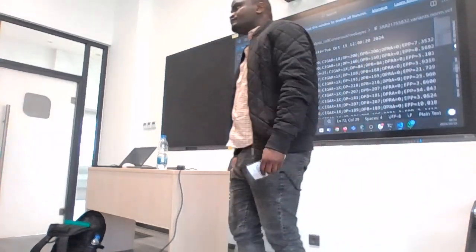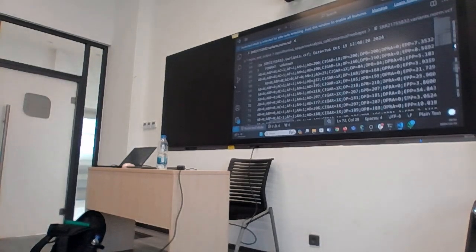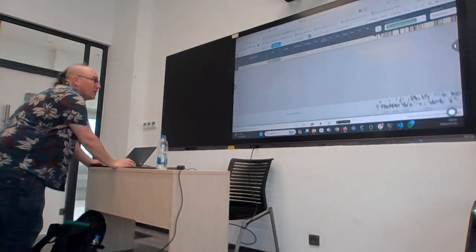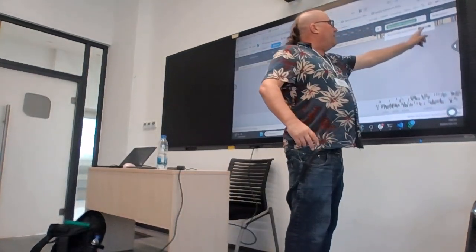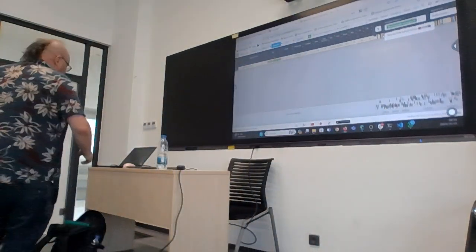And what we will look at later: we are now looking at the variants. Later, we will look at the reads themselves to see what that looks like. Okay? Just one last thing before I go off this. If we take nextclade, we can move here, and we can see the substitutions. A18769G. Okay?